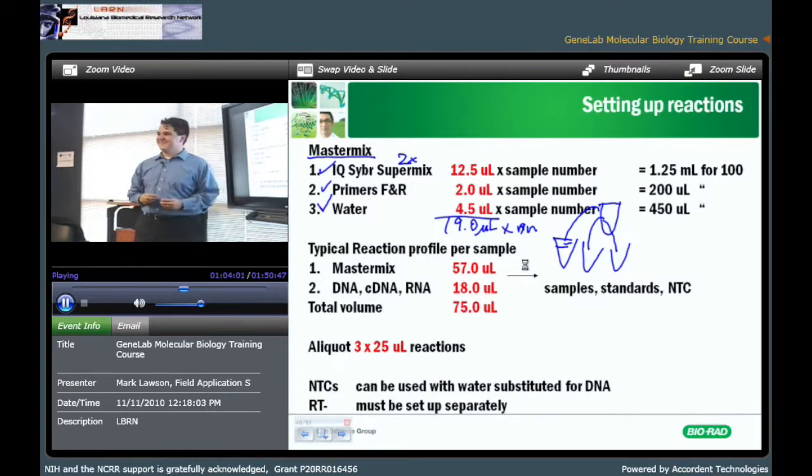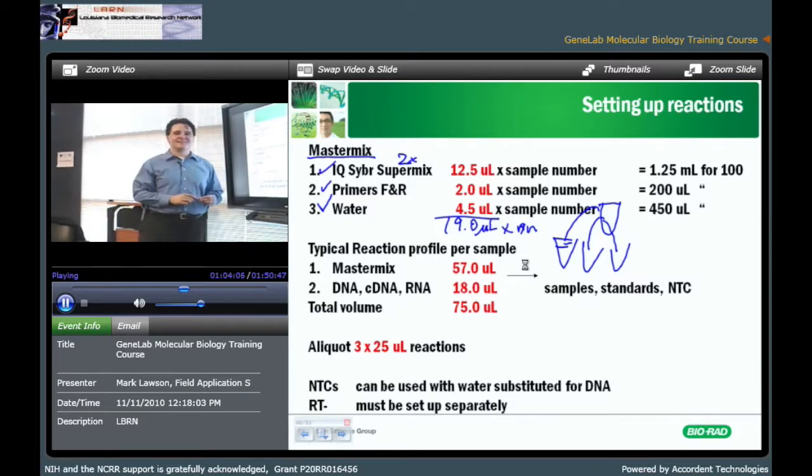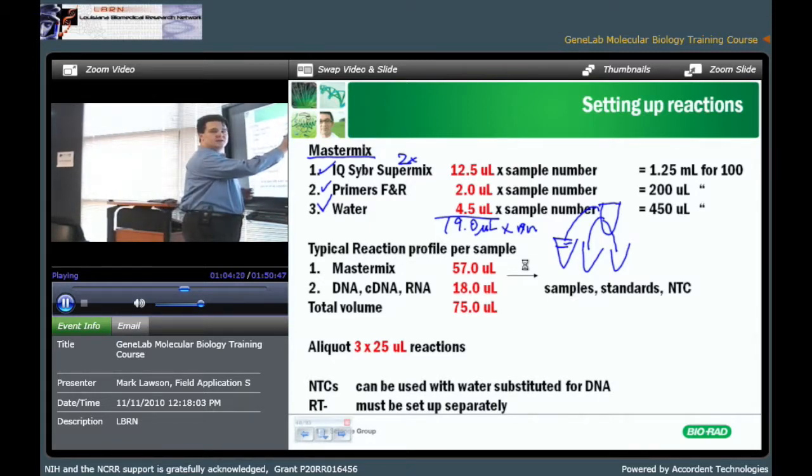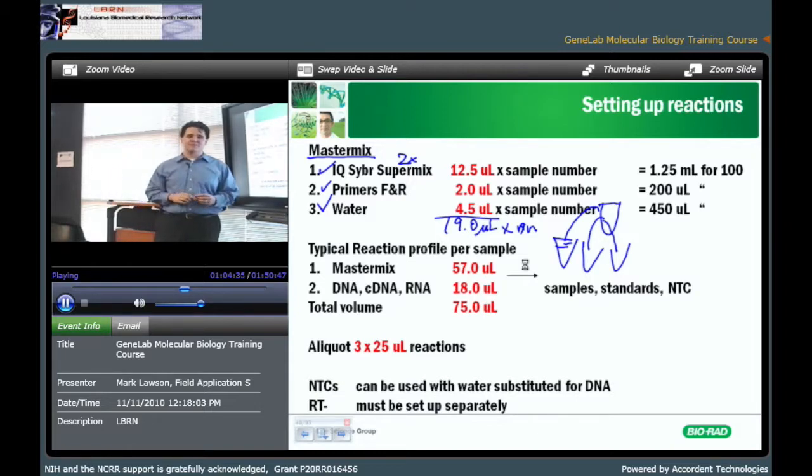I like that way. Yeah, so do I now. My boss would never have let me do this. He would have said that's not a true technical replicate, right? Because the samples, right up to the point where you split them out, were all pulled together. The upshot of this is that whatever was in here is chemically homogeneous. So when I sub-aliquot it, I'm not introducing any variability in my pipetting technique. So it eliminates the contribution of pipetting to variability.